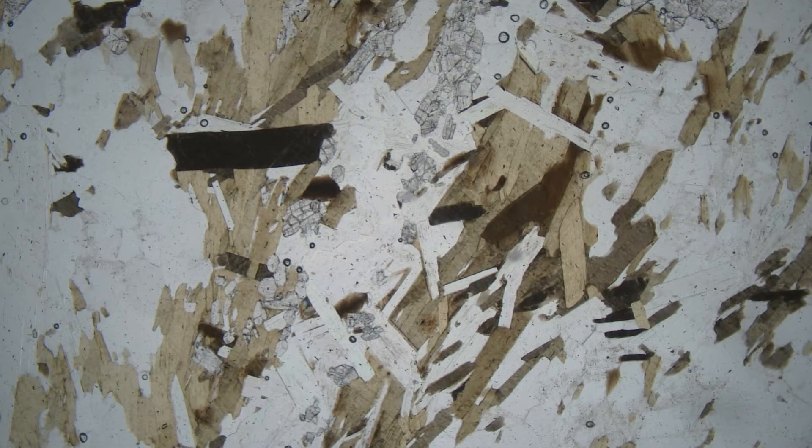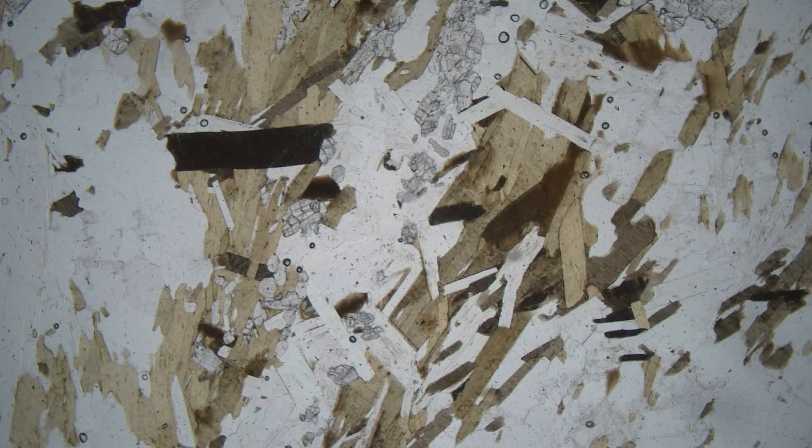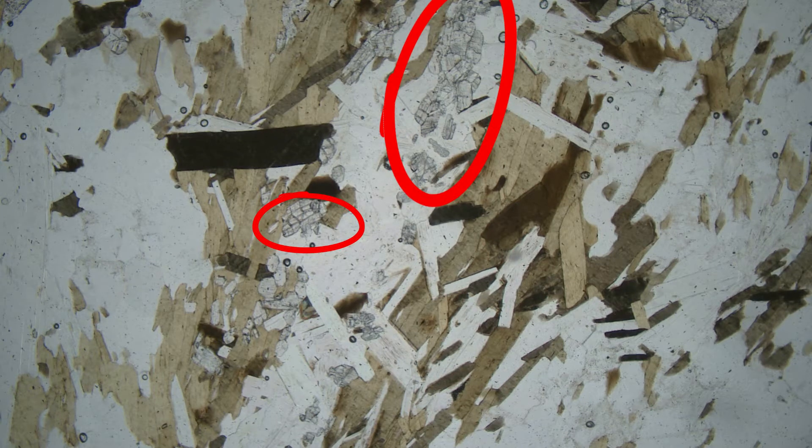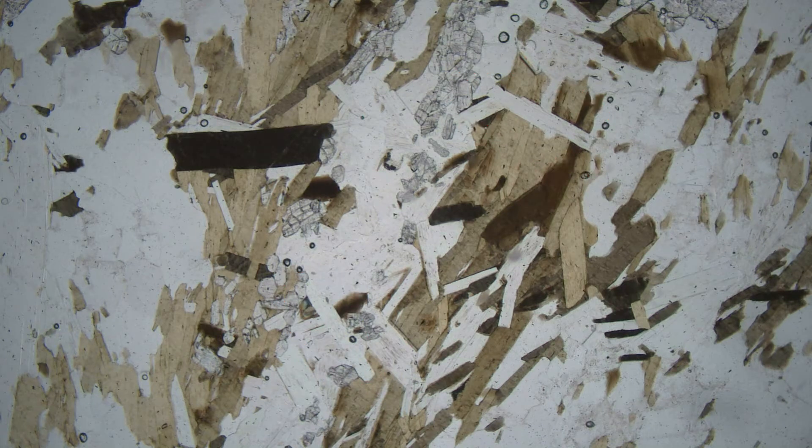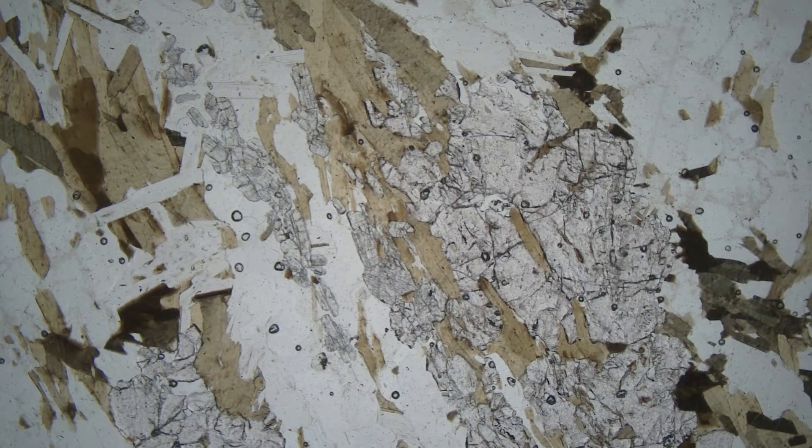This view shows a schist that contains brown biotite. It also contains a clear high relief mineral that is kyanite. The clear grains that have the same shape as biotite are muscovite white mica, and the background material is quartz and feldspar. As the stage rotates, we can see that biotite is pleochroic.